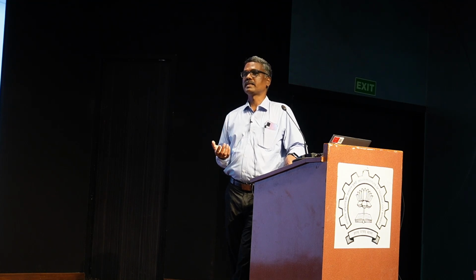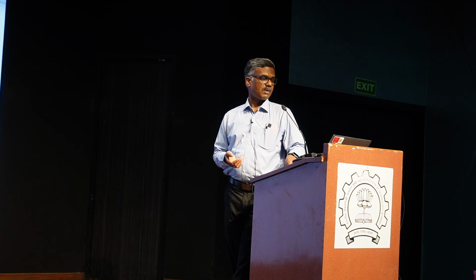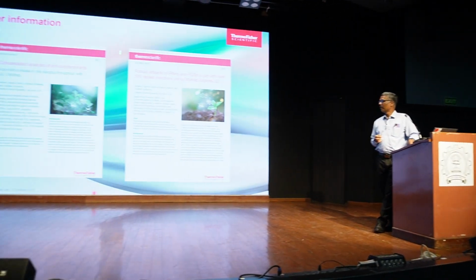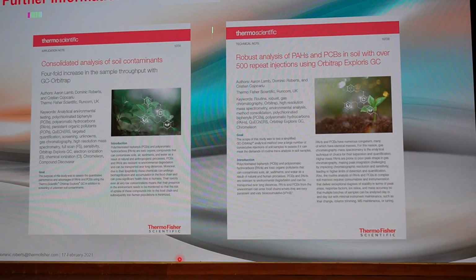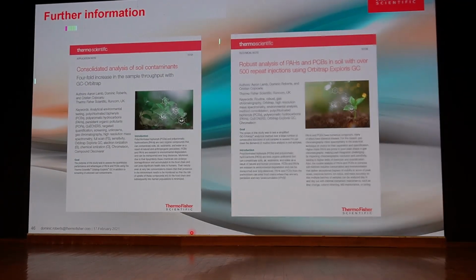Your sample preparation area should be much neater and cleaner. Otherwise, it will add some contamination from your lab itself. So you need to take precautions. For this, reference articles are available, so if you wanted to extend this work in your lab, you can refer to those articles and start this work in your lab with reference to your target matrix.